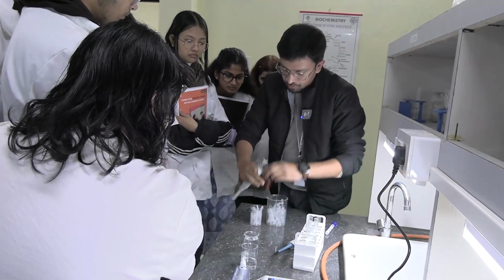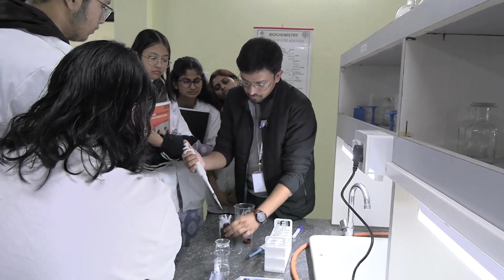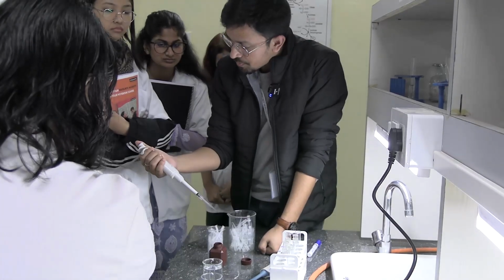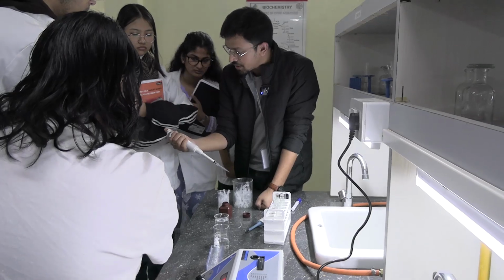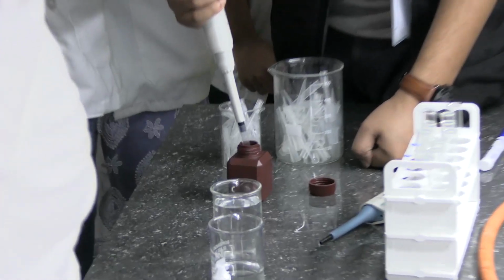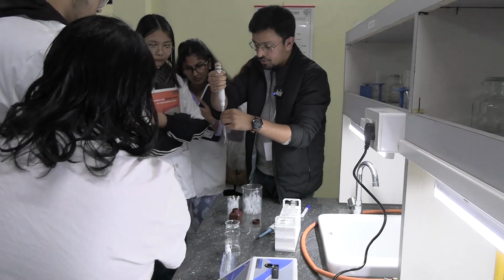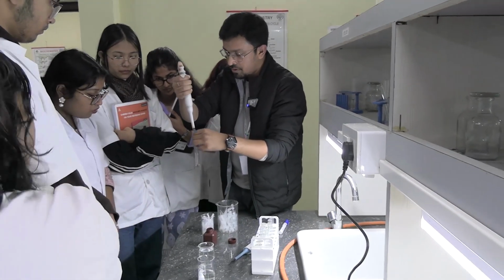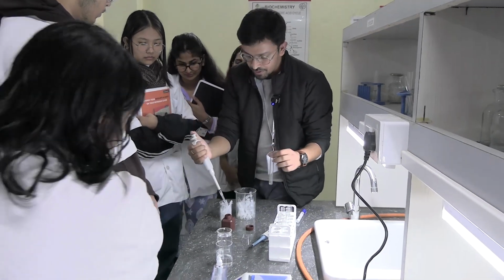Then after that we will take 1 ml of it. You have to just press it up to this much. After that you will get resistance, but after that also you can press, but don't press it. Press it up to this much, put it deep in, slowly release it. You are getting exact 1 ml. Take the test tube, put it inside, release the sample. At the end, forcefully press it. Everything came down, take it out. Your blank filled up, standard, same way.